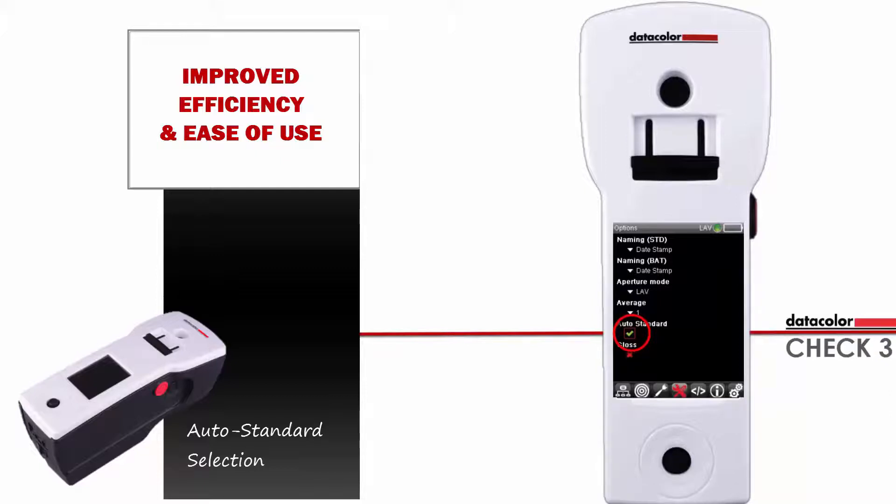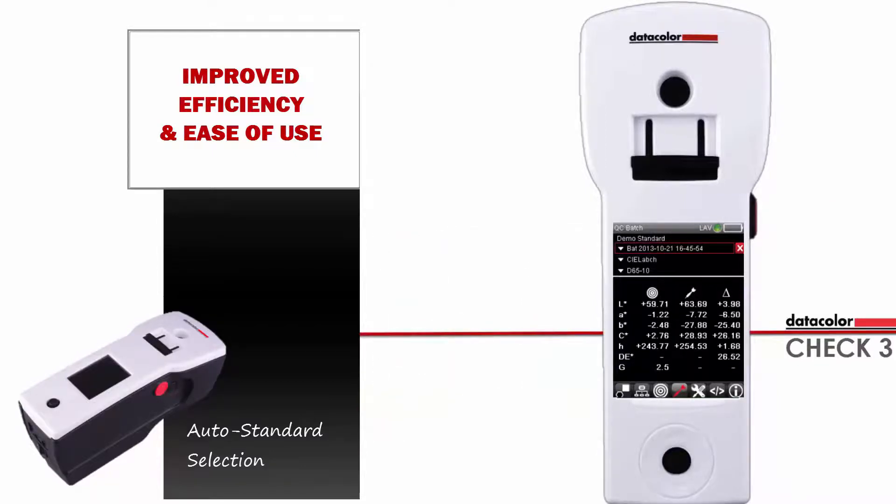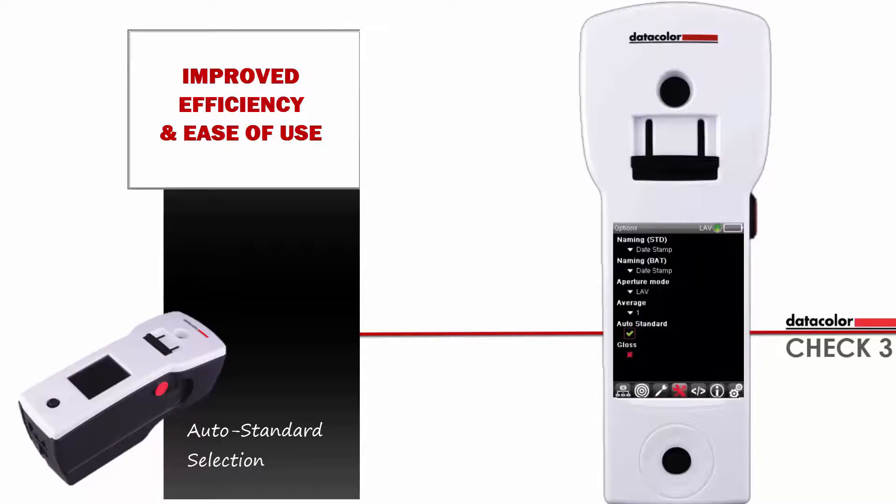We will now measure a blue sample. Press the left arrow to go to the batch option. Position your sample and press the measure button. After the auto standard selection message, the system shows the color difference results between the measured blue sample and the closest standard found on the device. The tolerance for auto standard selection can be modified on the settings screen; by default, the system uses one unit.